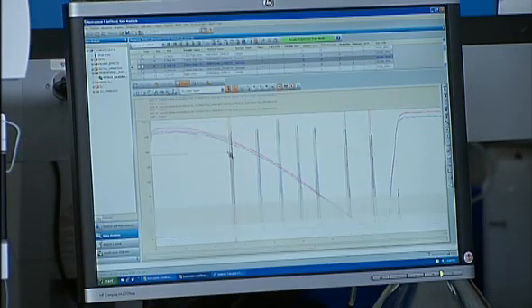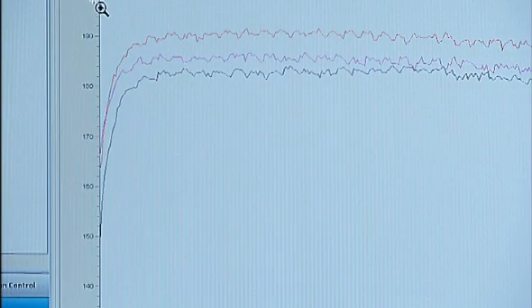I was able to go in and look at the system's pressure trace and see that the pressure at the starting point of each run was different. As it turns out, there was a slight leak in the injector. Not enough to present any obvious problem, but one that causes these changes in retention. If I hadn't checked my pressure trace, I might have spent a lot of time looking at other potential sources before I figured this out. That's really a great example, Mike.